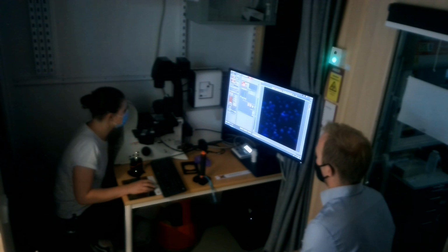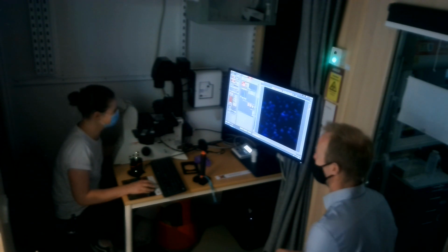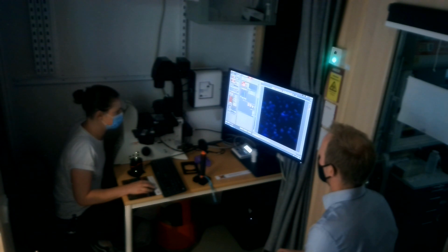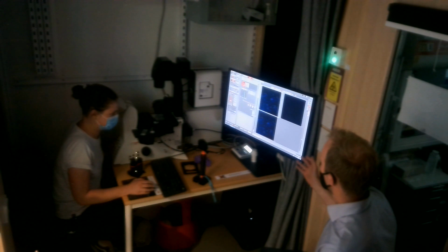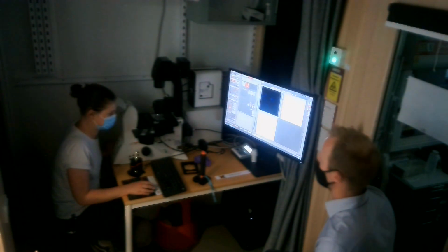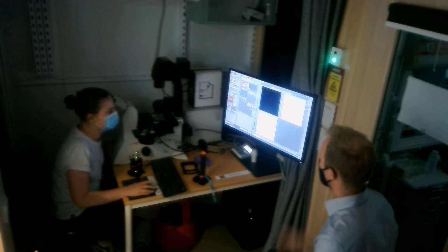Alright, so system optimized. Oh, big light. So you can just start this experiment. Once you're here, it's only going to do the experiment here. So if you had set something up in Navigator, if you started there, it doesn't feel that. So it will just do this.